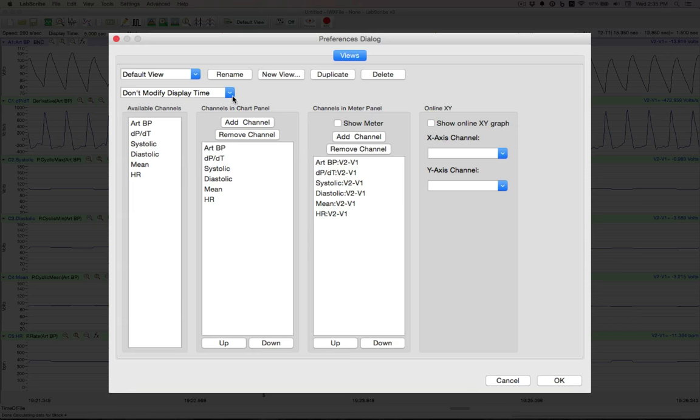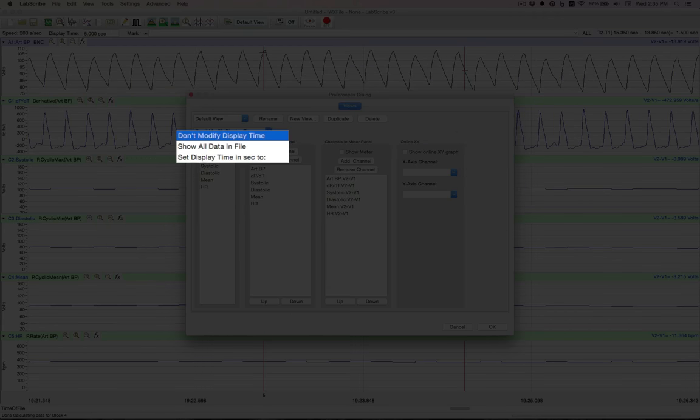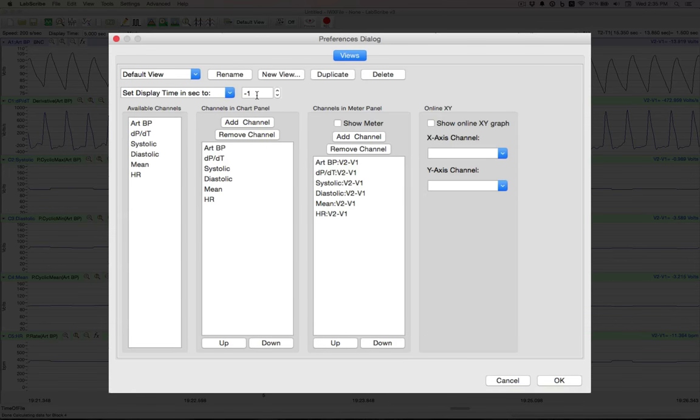Since this is our default, let's set our display time to 5 seconds. So we always come back to that.